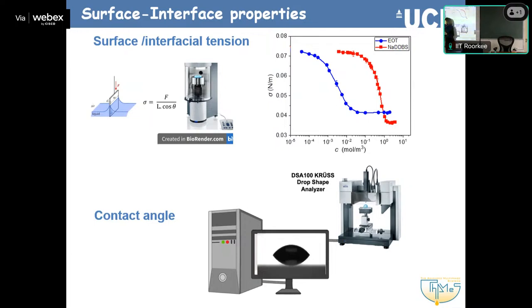The contact angle, the assumption is that the contact angle here is very good. So the liquid is wetting this plate. This plate is of specific material, so this contact angle is known. So when we do that, we can get these types of curves of surface tension. And this is an example here, just to show you what else we can do. If we have a pure liquid, pure fluid, we will just get one value.